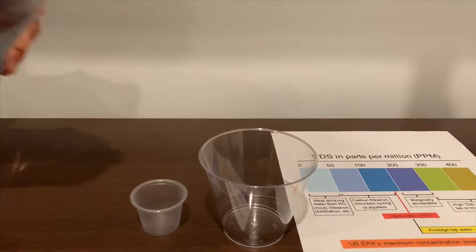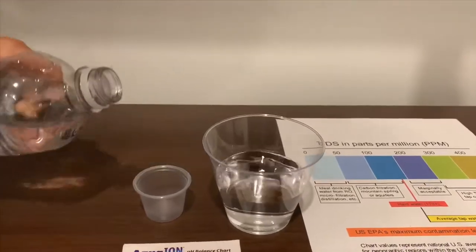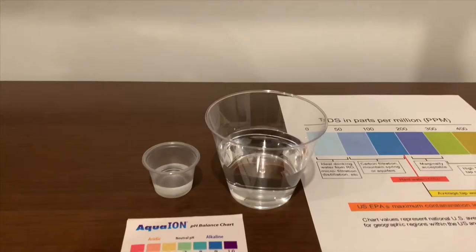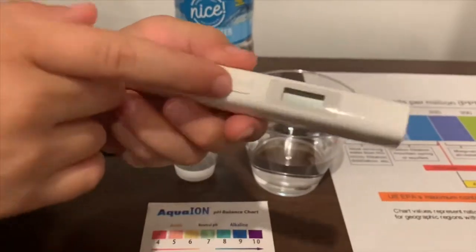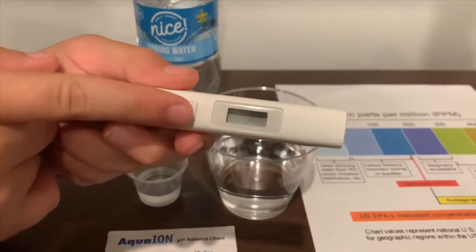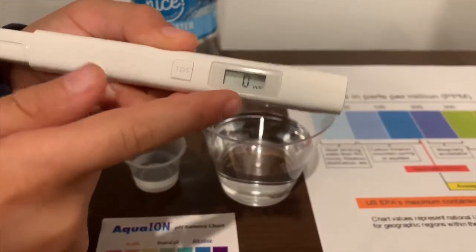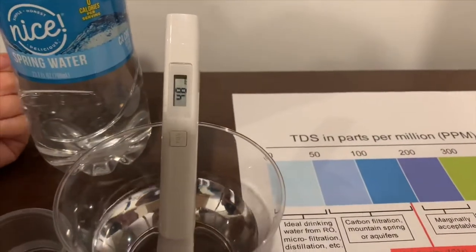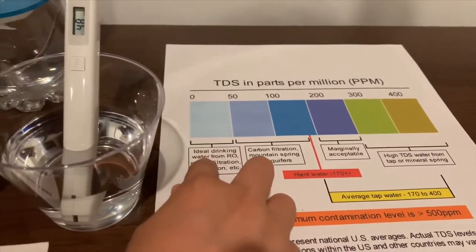Let's pour some water in. First we're going to test the TDS level. If you want to buy this TDS tester, check the link down below. Turn on the TDS tester, make sure it says 0, and let's put it in. 48 — that is ideal drinking water.